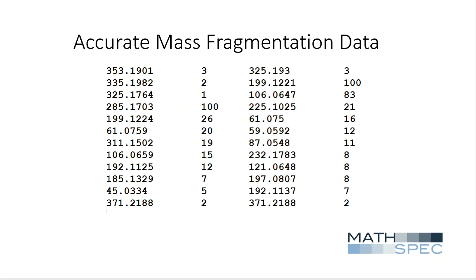To avoid repetition, I will assume that you have already seen the YouTube video Transform Mass Spectral Data into Viewable Models. In that video, an analyte of molecular weight 370 was partitioned into 10 sets of subfragments and subformulas. In this video, we will compare those 10 sets of partitions to a slice of 8,870 molecules in Pubchem Compound that have virtually the same molecular mass.